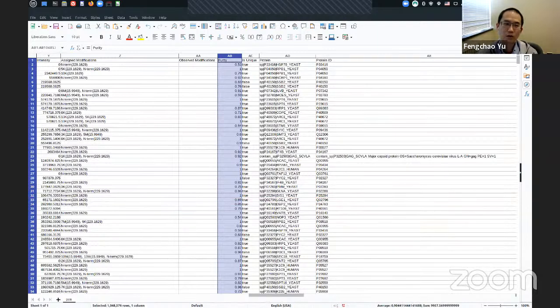Yeah, I'm talking about the default value, which is closed search. It just does the identifications, and yes, the default workflow doesn't even have the quantifications. So the default workflow should work for the DDA, PRM, SIM things. But if you go to the quantifications and want to use MS2 quantifications for PRM or SIM, our tool cannot do that. But if you want to use MS1 quantification, yes. It's not about TMT, or it's not about a PTM.